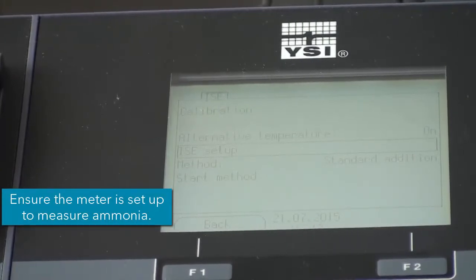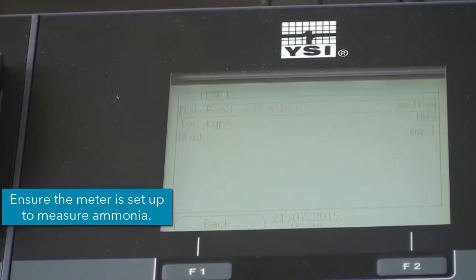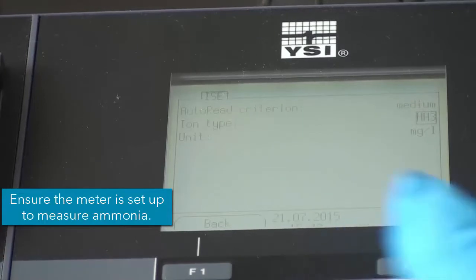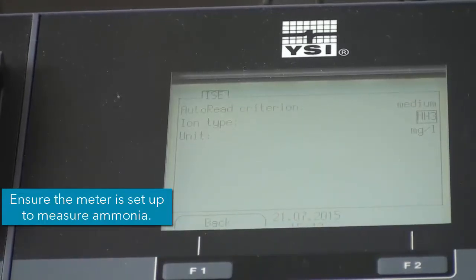So I will go into ISE setup, and I will choose the ion species that we are interested in. So you can select from a lot of different ion species, but we will select ammonia. So NH3.